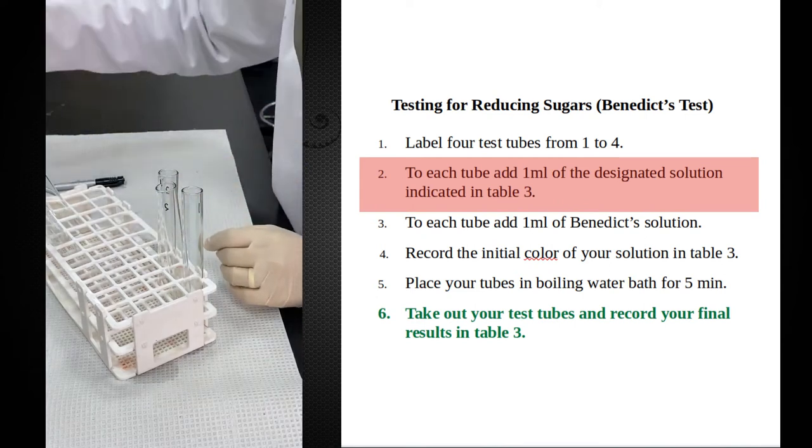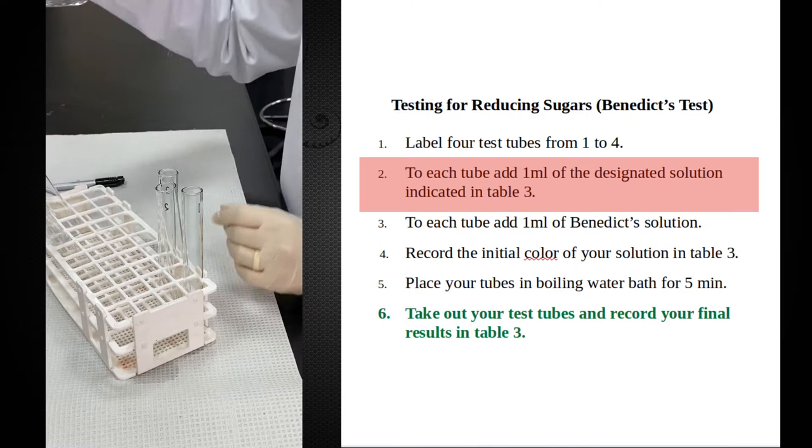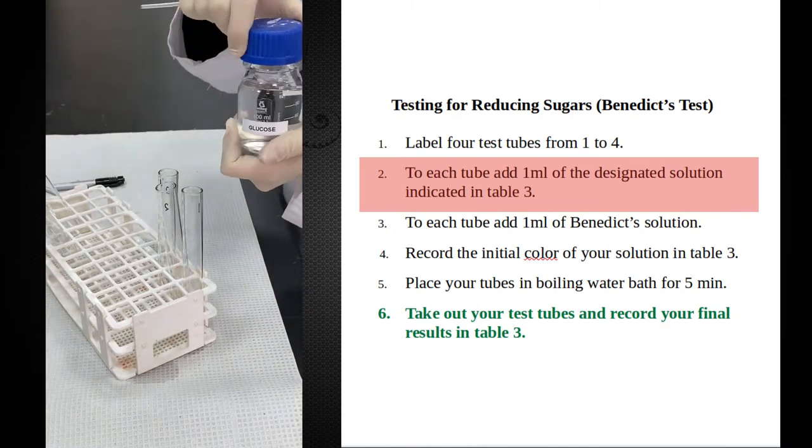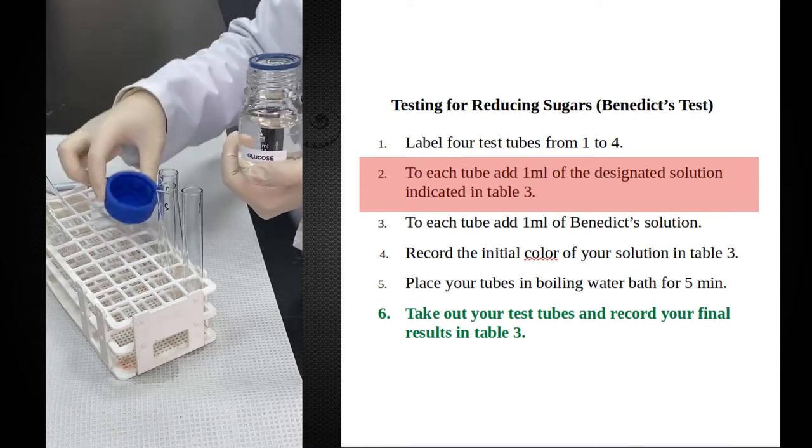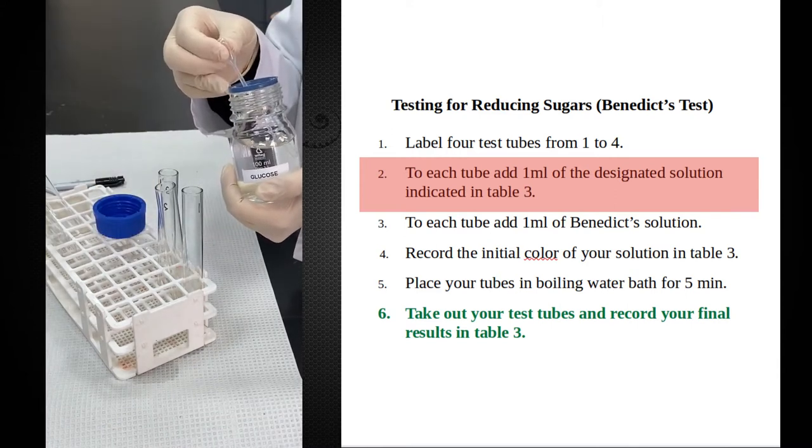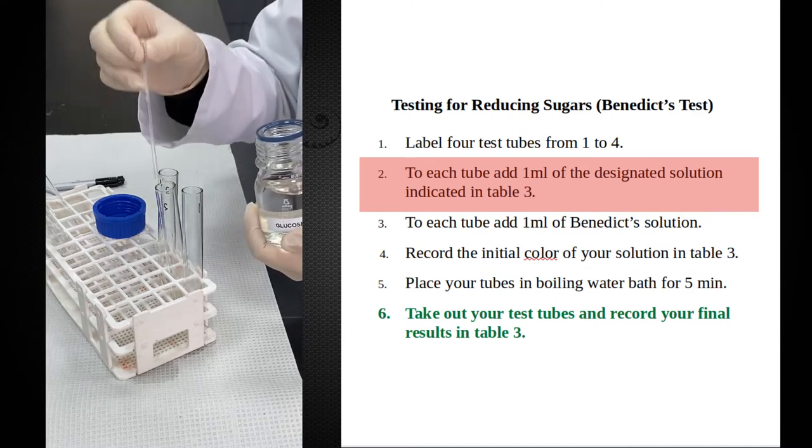The second test tube is going to be a positive control. As you know, all monosaccharides are reducing sugars, and for a positive control purpose I will use glucose, which is a monosaccharide and therefore a reducing sugar. One ml of glucose.